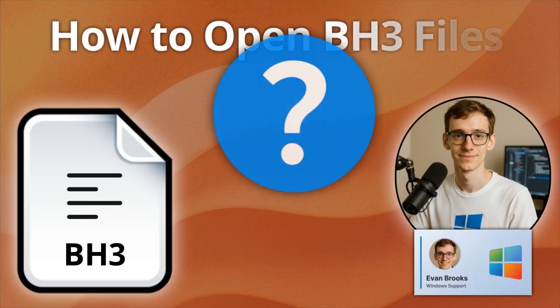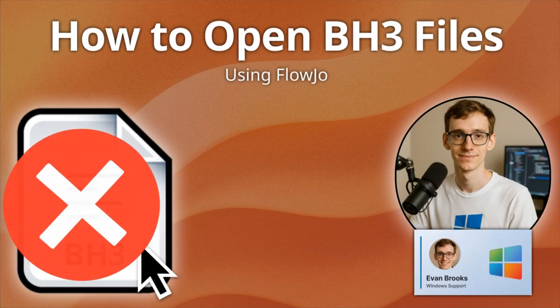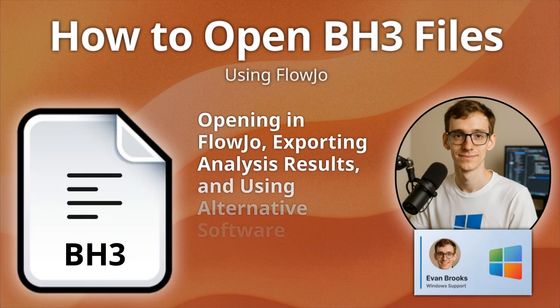Working with flow cytometry data and got a BH3 file? This is a workspace file from FlowJo Cytometry Analysis software. I'm Evan Brooks, Certified Support Engineer, and I'll guide you through opening these FlowJo Workspace files.